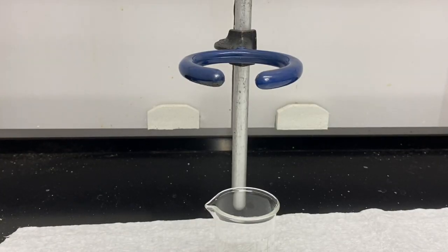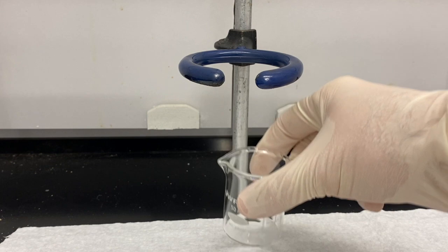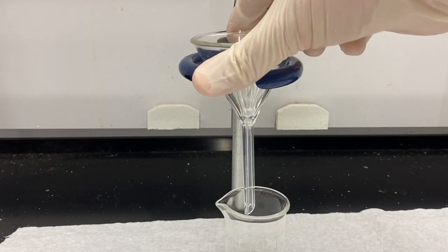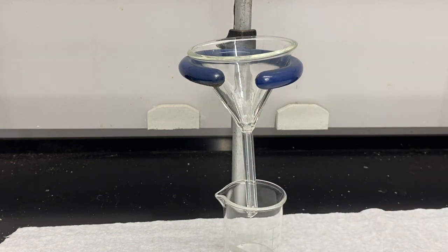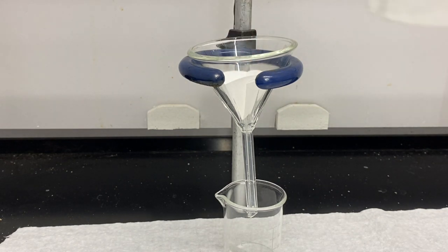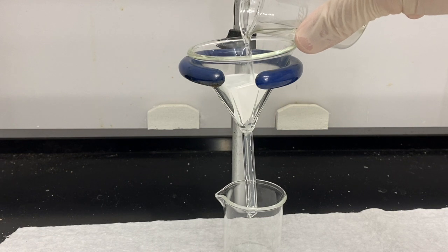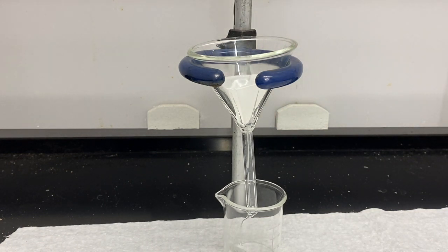Alright, so now I have to filter off that solid to get it away from the dichloromethane and my product. So I'm going to use gravity filtration. I've got my pre-weighed 50 mL beaker, a glass funnel, and I have a piece of filter paper that I folded into quarters so it's kind of a little cone shape and fits in there nicely. I'm just going to take my solution with my solid in it and I'm going to carefully pour it into the funnel and let it drain down, and do that until I remove all of the solid.